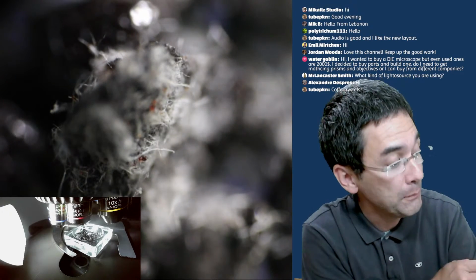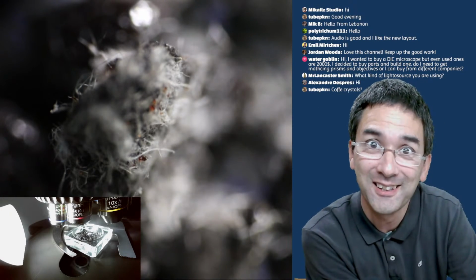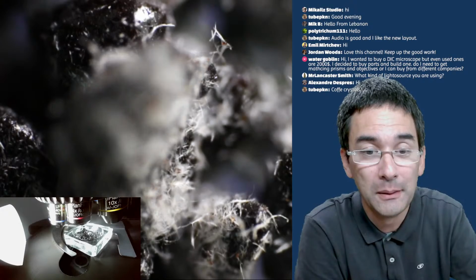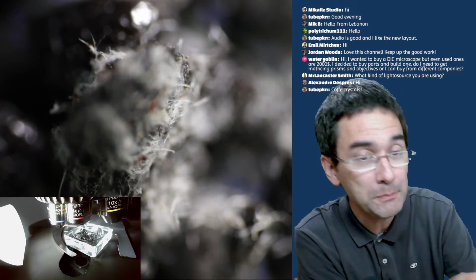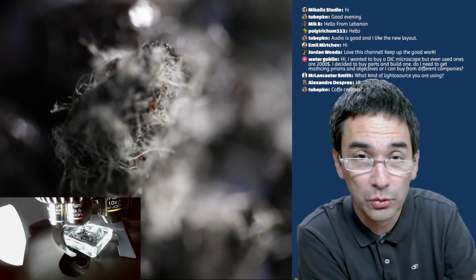As a matter of fact, when I put this under the microscope, I could not see any cells, and the crystals disappeared, and then it recrystallized. I'm going to make a video on this on my other channel, where I report back on this. This is something that I considered a little bit fascinating, because I would not be able to see it like this with light coming from the bottom, because the instant coffee grains are too dark.